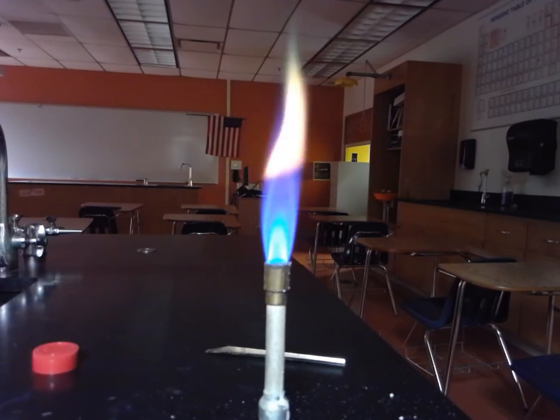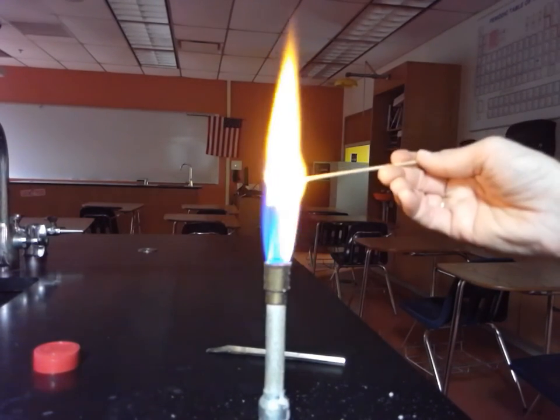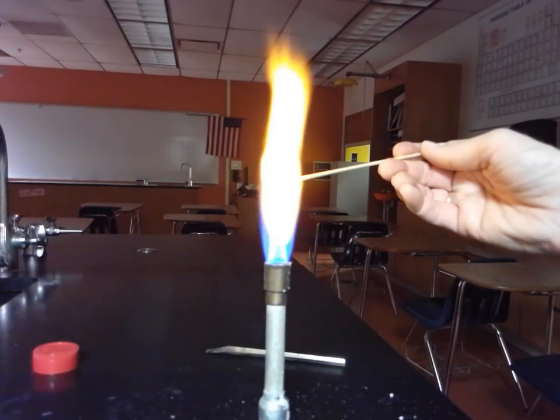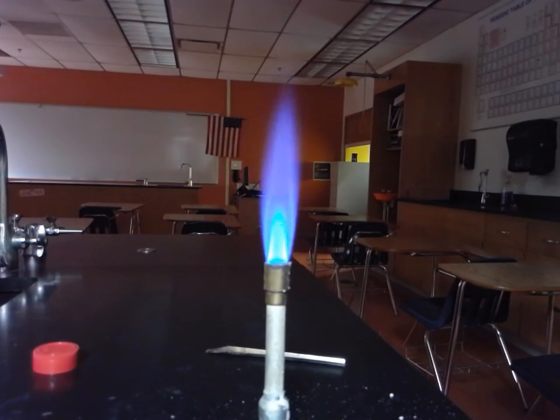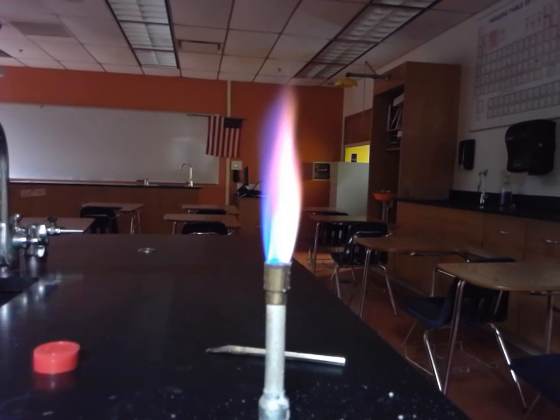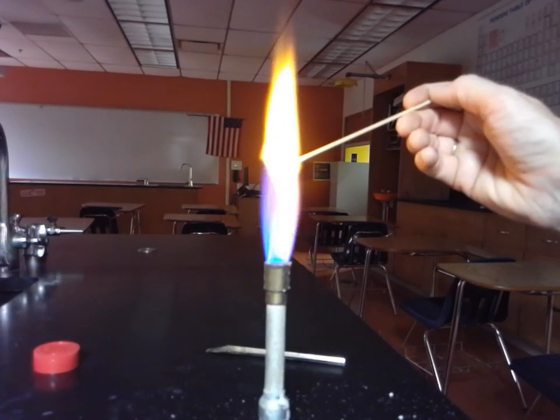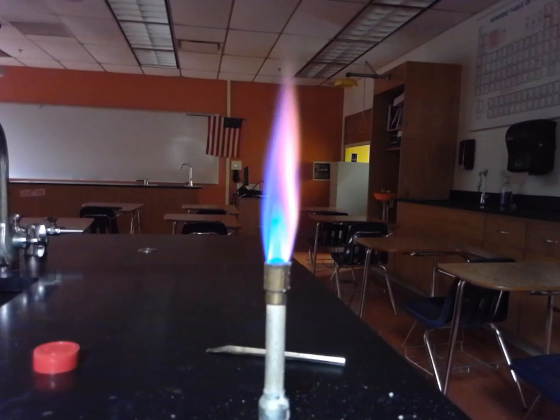All right, this is the unknown. Oh, perfect, it's blue again. Yay! This is the unknown. So I mixed two of them together. I'll do that again. Thank you for your patience. I don't even know if we'll be able to upload this onto YouTube. Oh, I have to do it again and do it quicker. Okay. And that is the flame test.